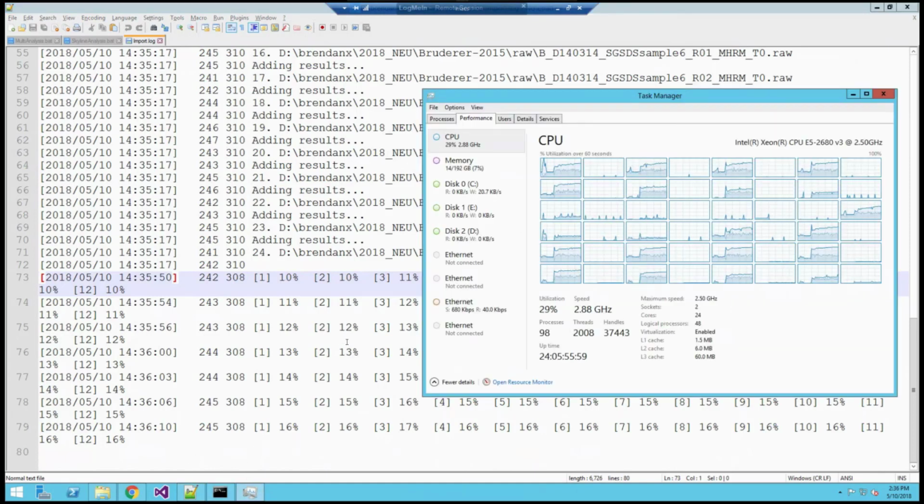And if we switch back here, at this point, you look at it and you go, hey, you're not using all the processors. And that's true right now, but we'll see. By the time we leave here, this CPU is going to be pegged at 100%. At this early point, it's doing a lot of data reading. I don't know, you can't see how stressed the disk is. But mostly it's just trying to figure out where the iRT peptides are right now. Once it gets over 40%, then it's going to start really doing a lot of calculation, and you're going to see that more of the CPU gets used.